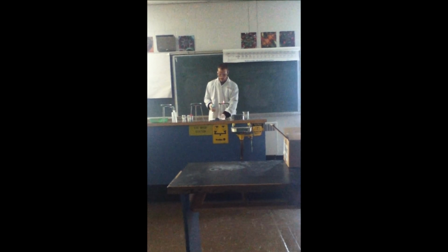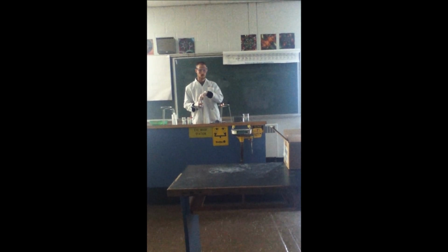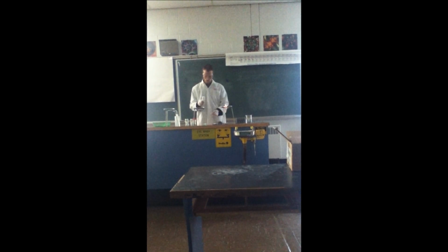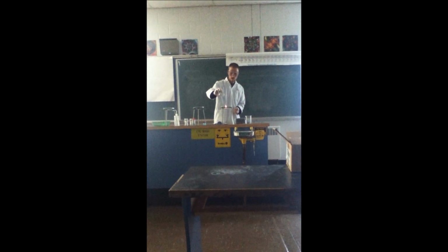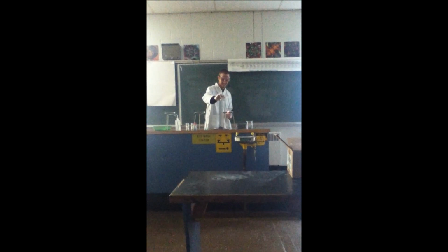Okay, we have several different other chemicals here that we can add to see different colors in our flame. Can you do both? Okay, we've tried strontium. Now we're going to try copper chloride. Okay, copper chloride should make the flame blue. All right? All right, so you see that? Yeah, we've got our reds and our greens going there. Okay?